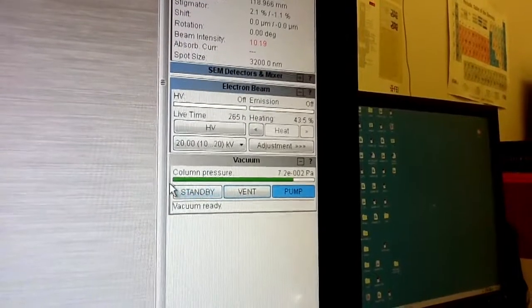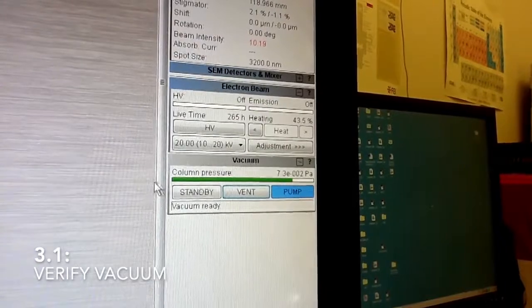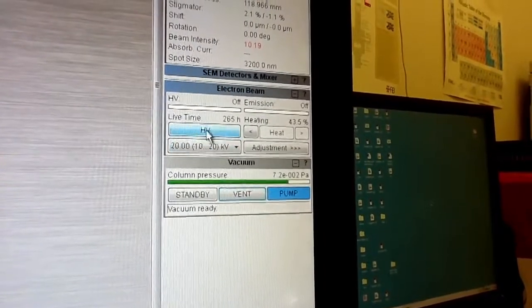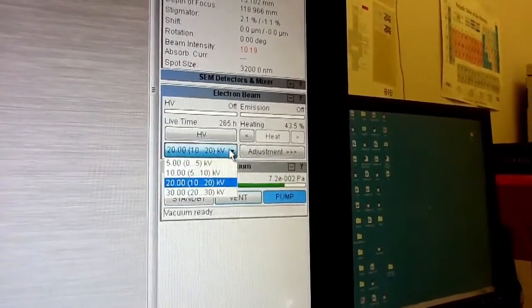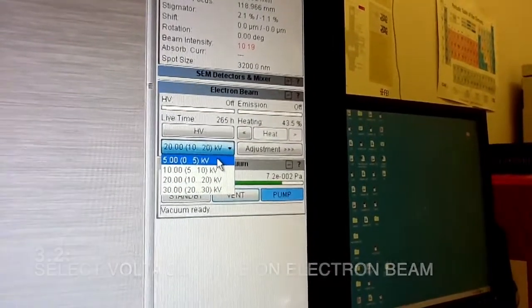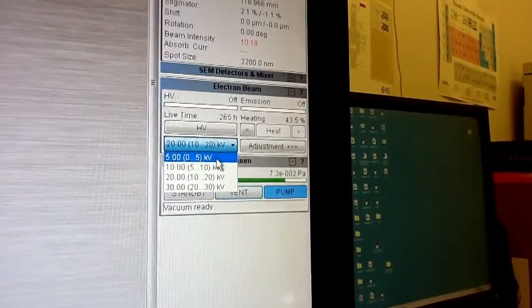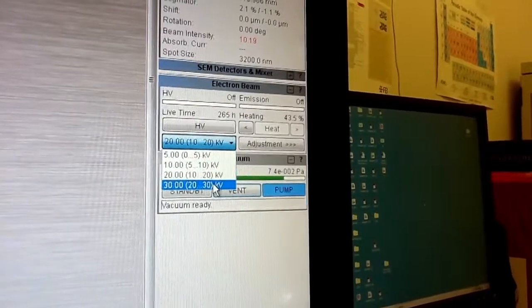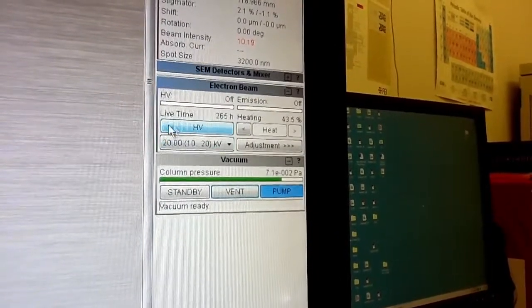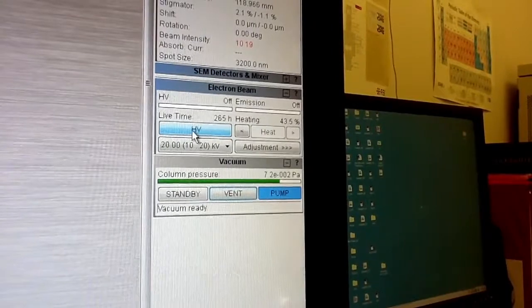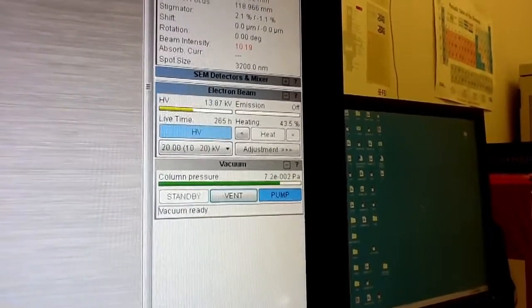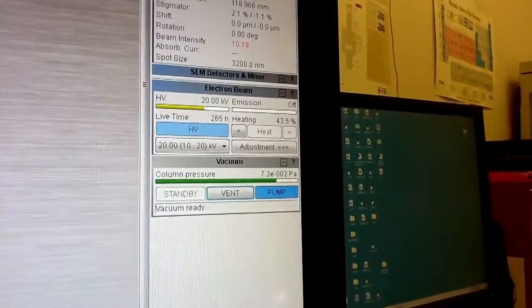Once your vacuum is good you will see this green bar representing a good vacuum, and you are ready to start high voltage. You can select between four different high voltages: 5, 10, 20, and 30 kilovolts. Let's choose 20, then just press the HV button. This will start high voltage.